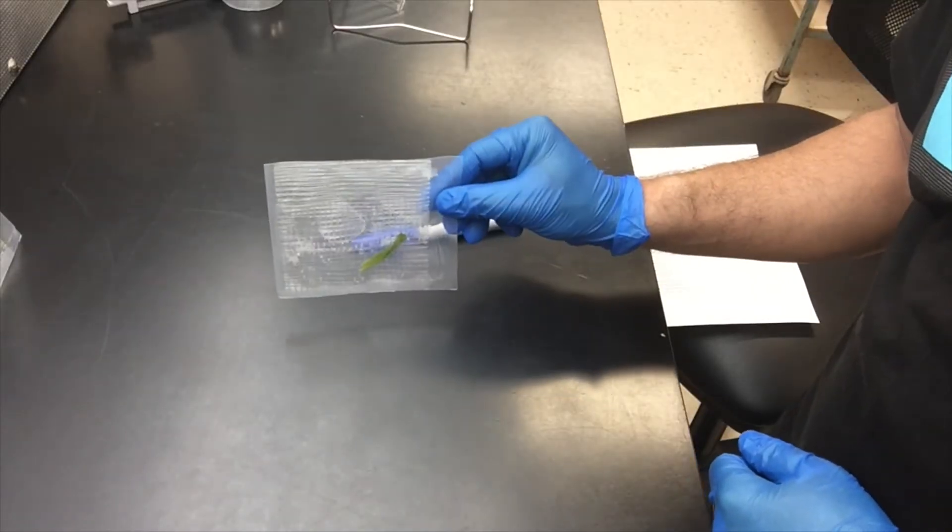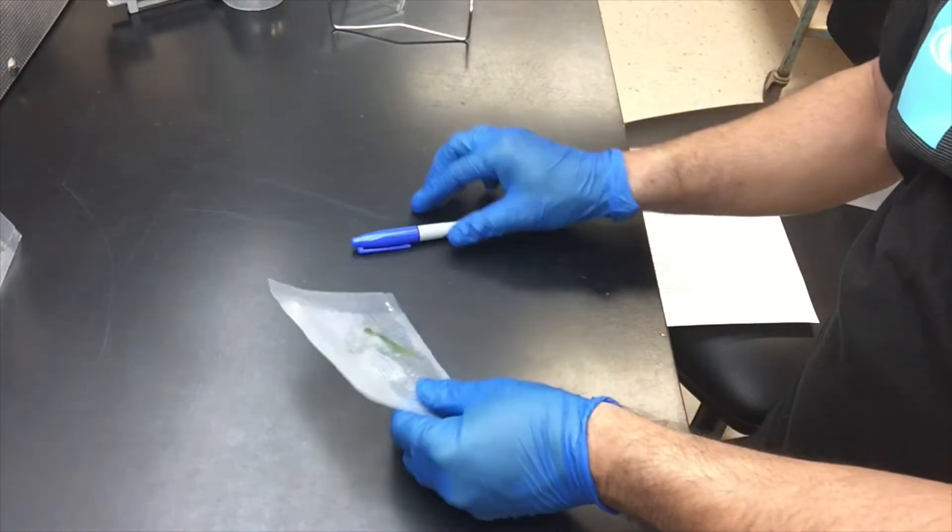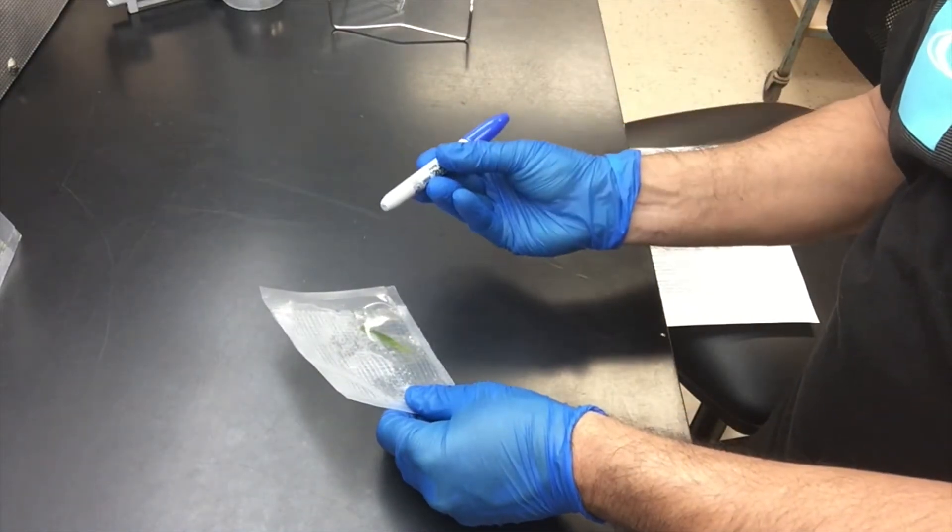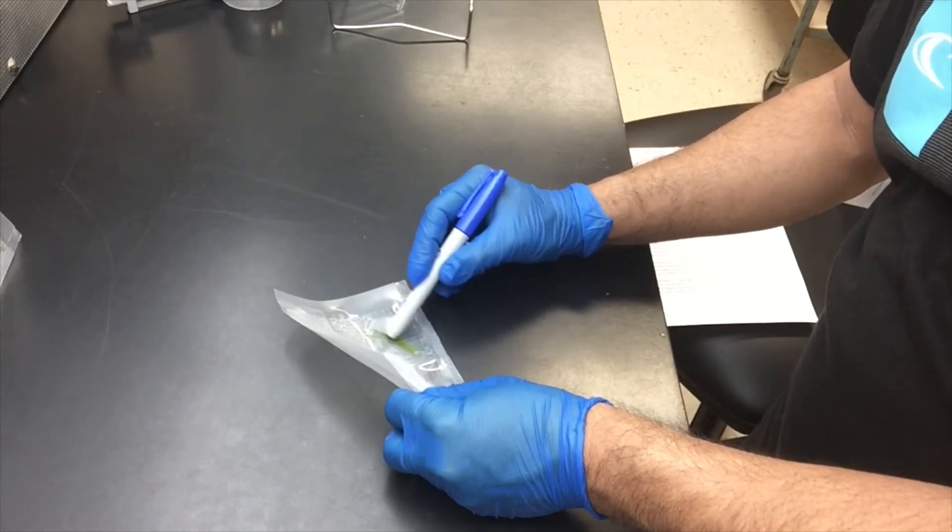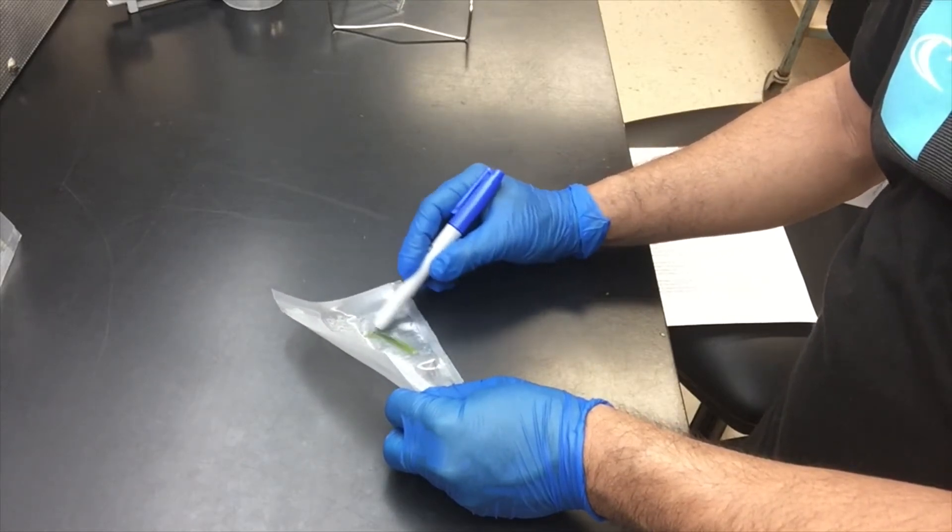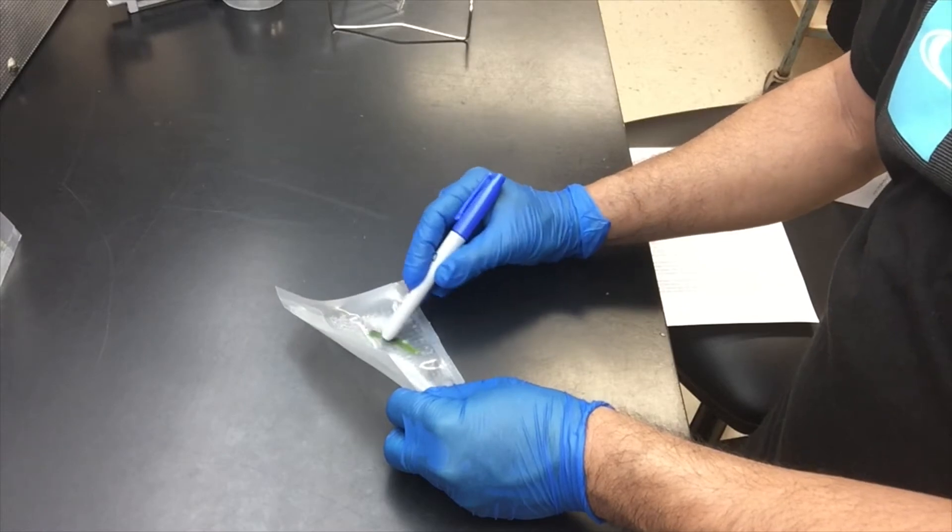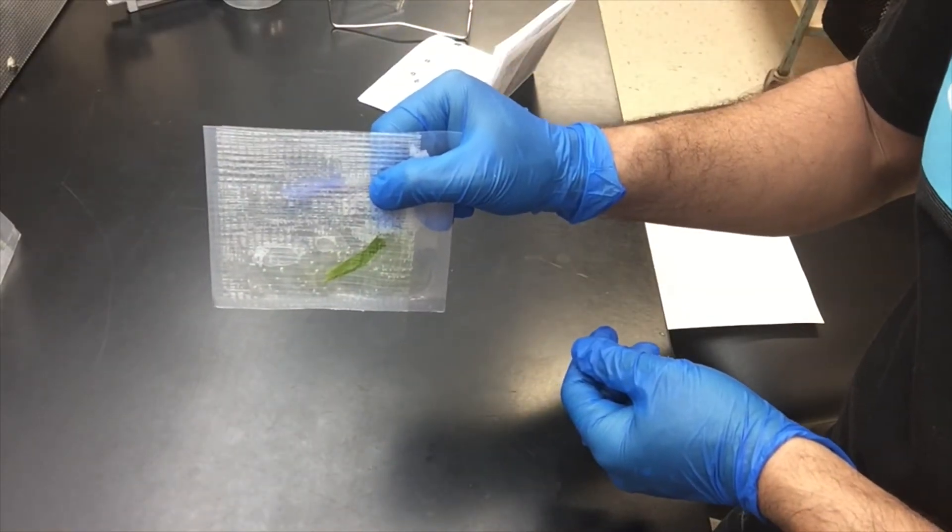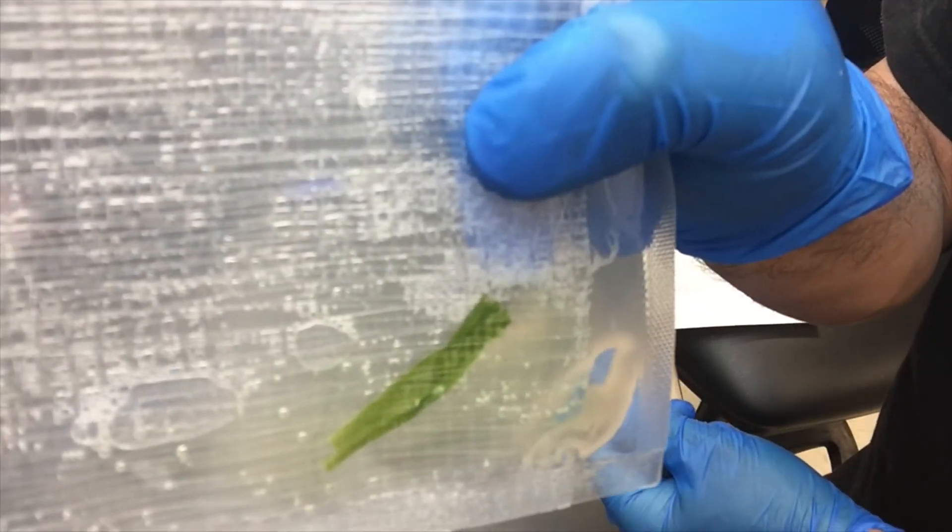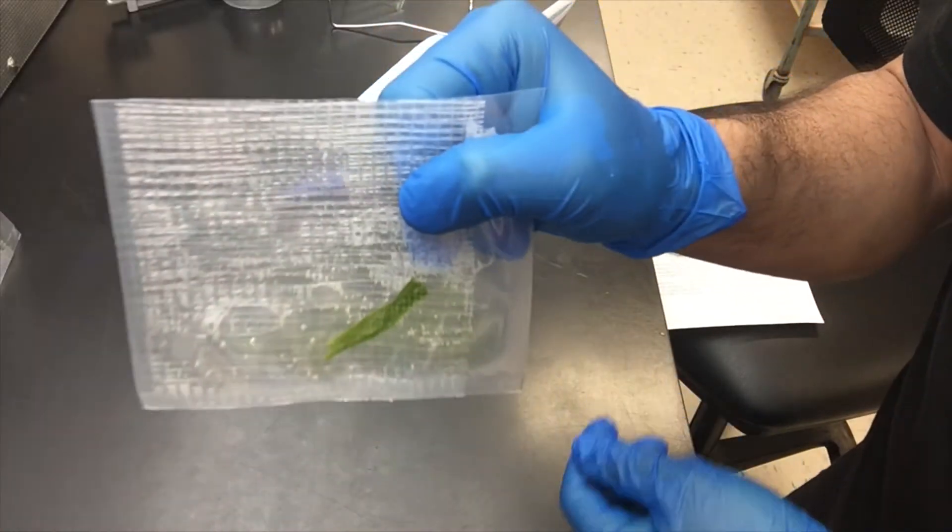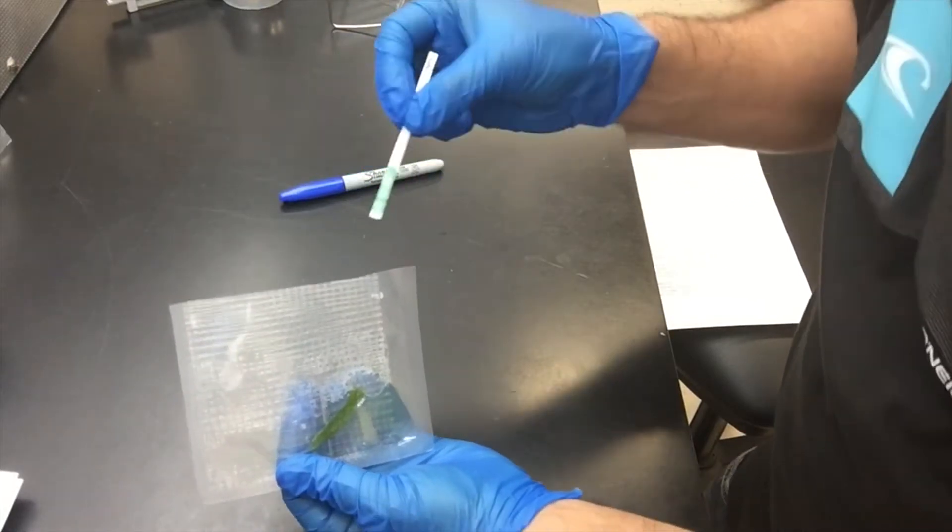Extract the sample with a blunt object, for example a sharpie in this case. Be gentle during extraction. Avoid tearing the bag and producing excess foam. You can see the homogeneous light or dark green colored solution. Allow the solution to settle for 2 to 3 minutes before inserting the immunostripe.